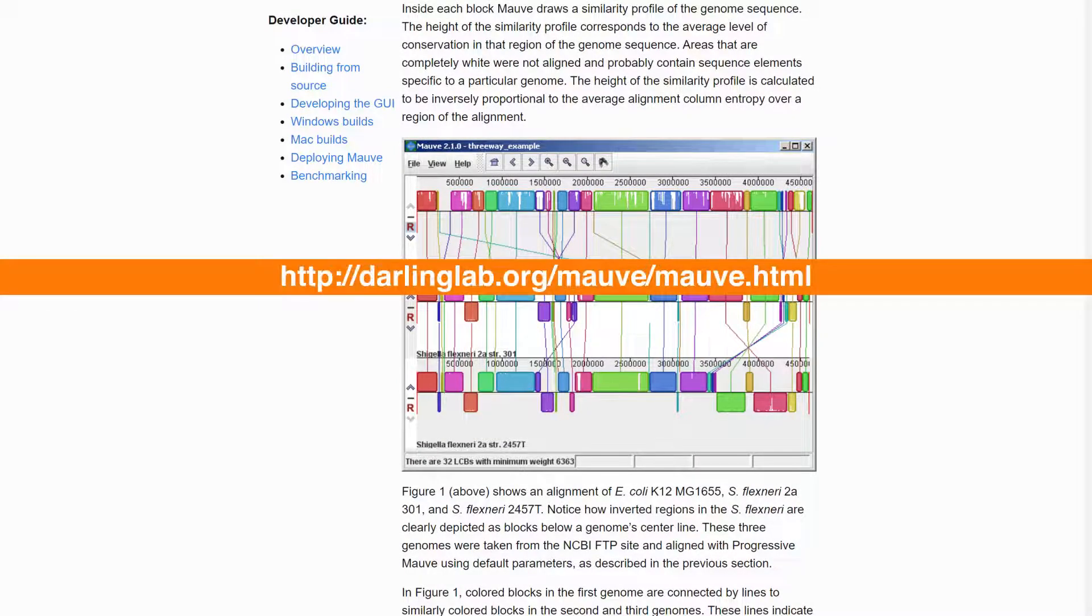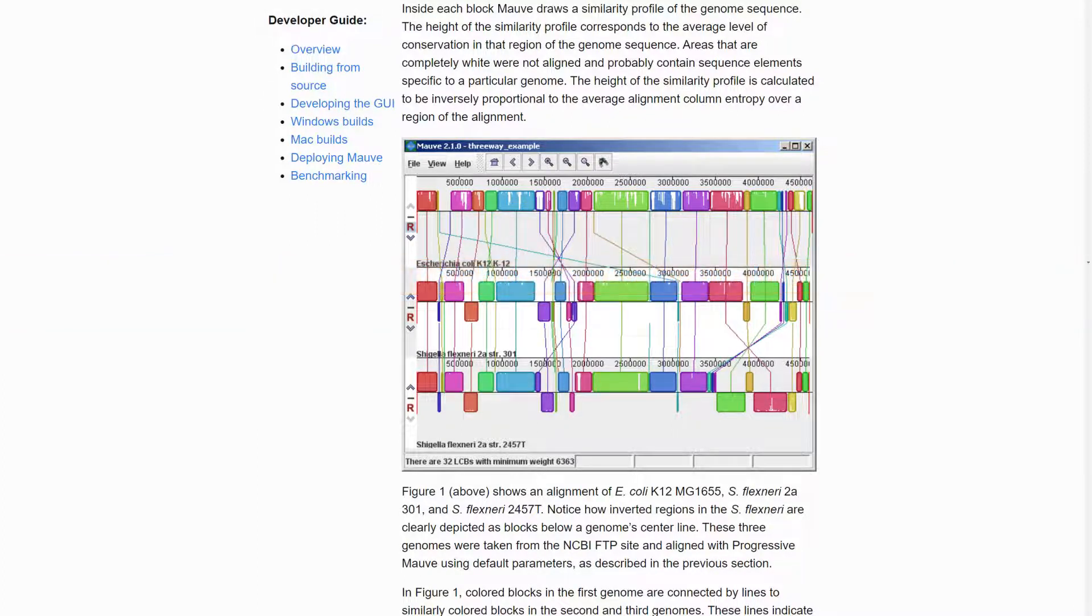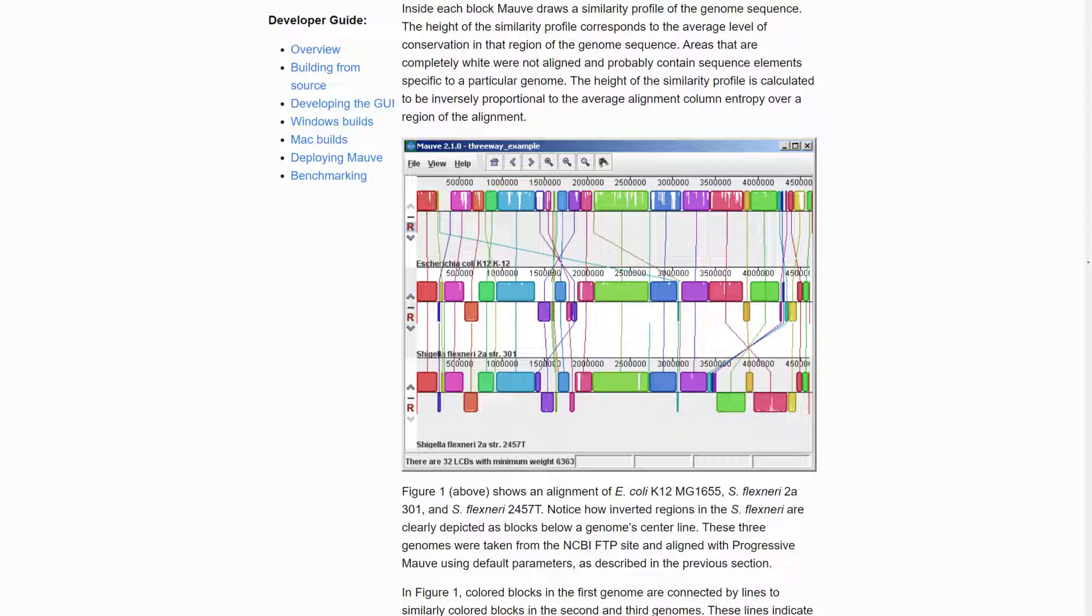MOV alignments have a special viewer that enables you to see genome rearrangements and locally aligned blocks at a glance. Each sequence is represented by one horizontal panel of blocks.